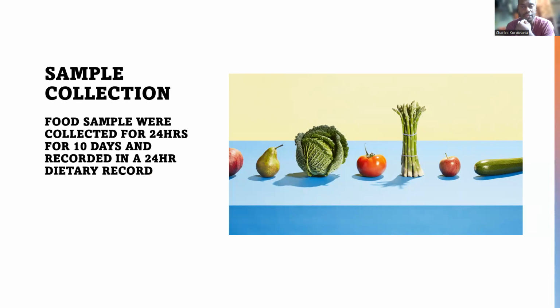All the food samples were brought to the lab and stored in the deep refrigerator. Weighing of the food sample: unfortunately, my video here could not show. It should show me weighing the food samples on the balance.